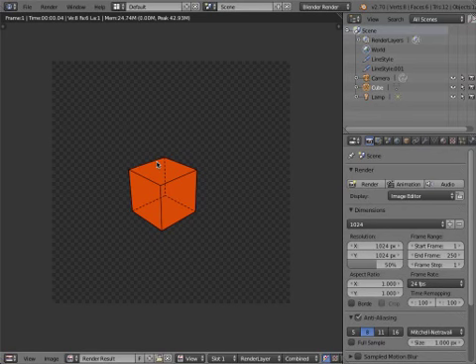Don't worry about the line sets. If you would really need to work with that, you can go back into the video and have a look. All right, so everyone's gotten their first render now, I suppose.